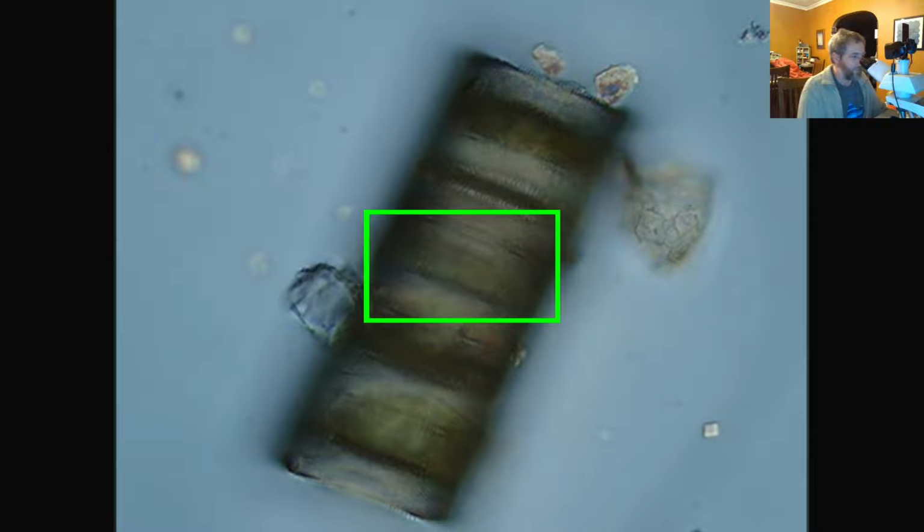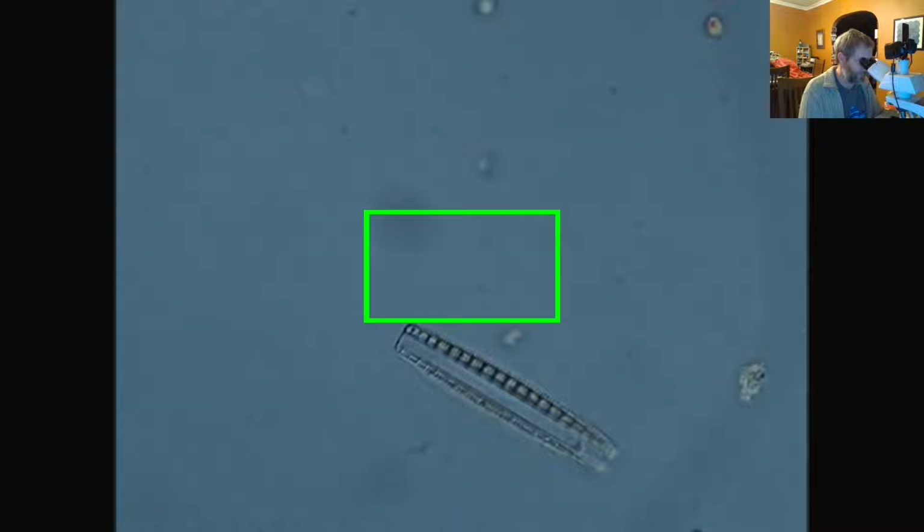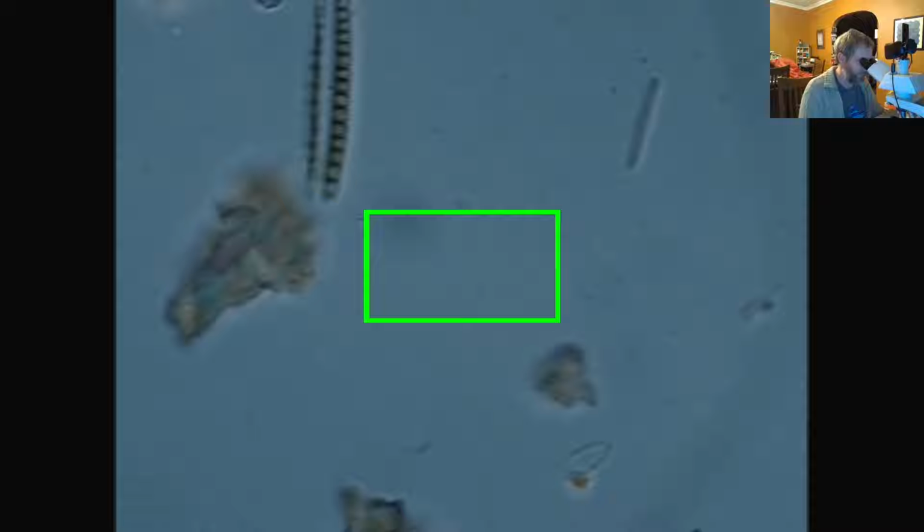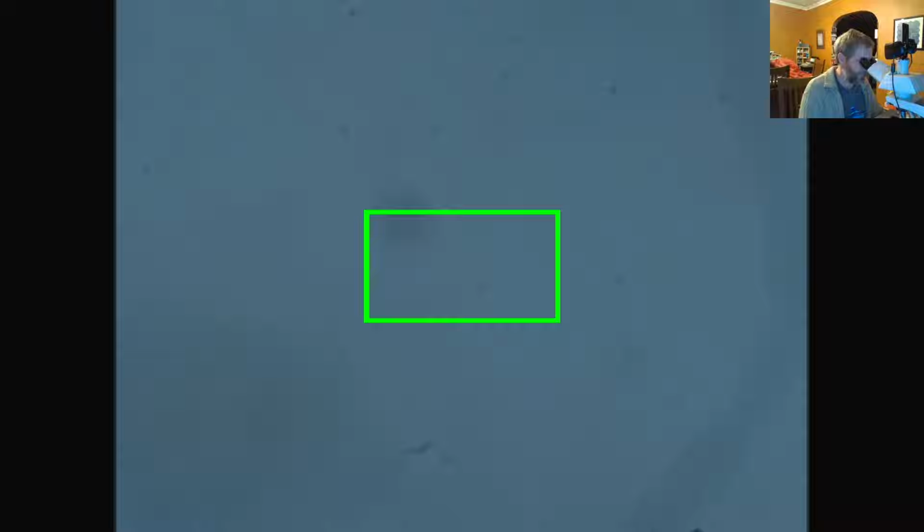What I do is paleoenvironmental reconstruction using these as a tool. So here's Rhoicosphenia, as I mentioned, that's a flowing water indicator. That's Gomphonema, another flowing water indicator. This is more Gomphonema, so the whole thing is filled with it. And we saw a bunch of Rhoicosphenia earlier. We saw a few cases of Reimeria and those really large Gomphonema.